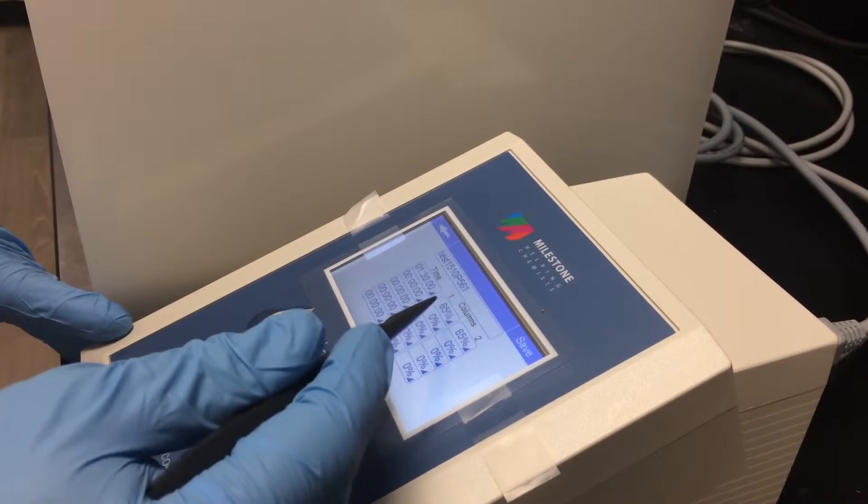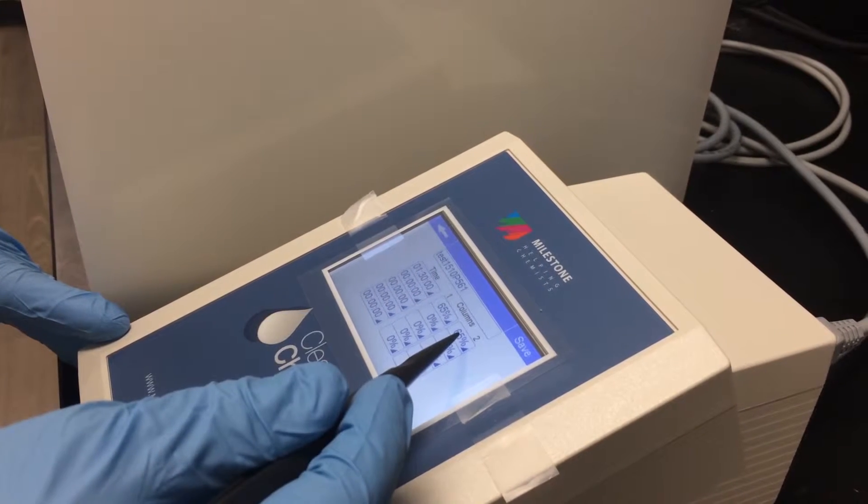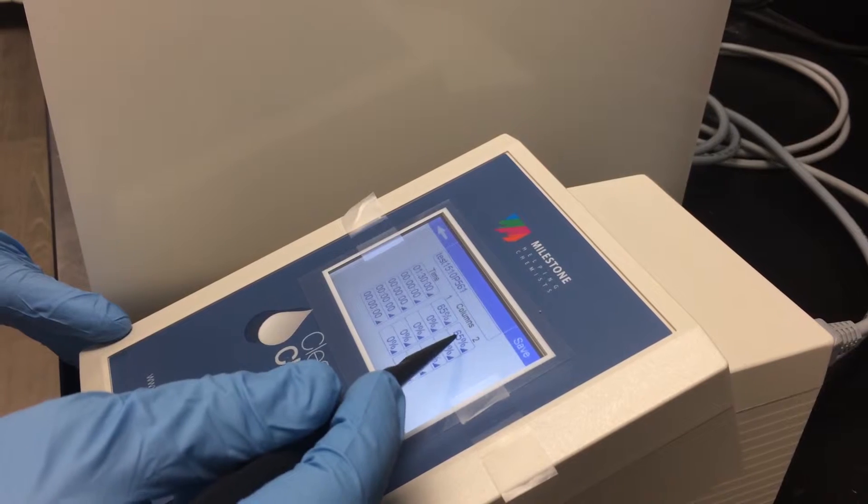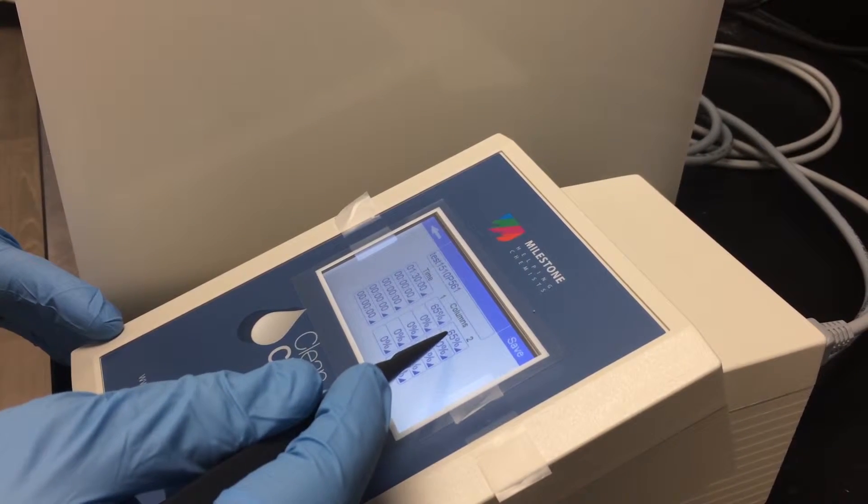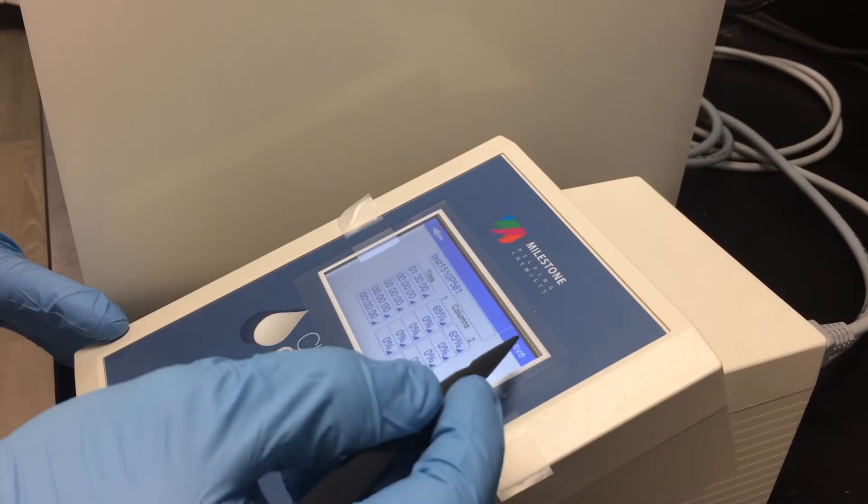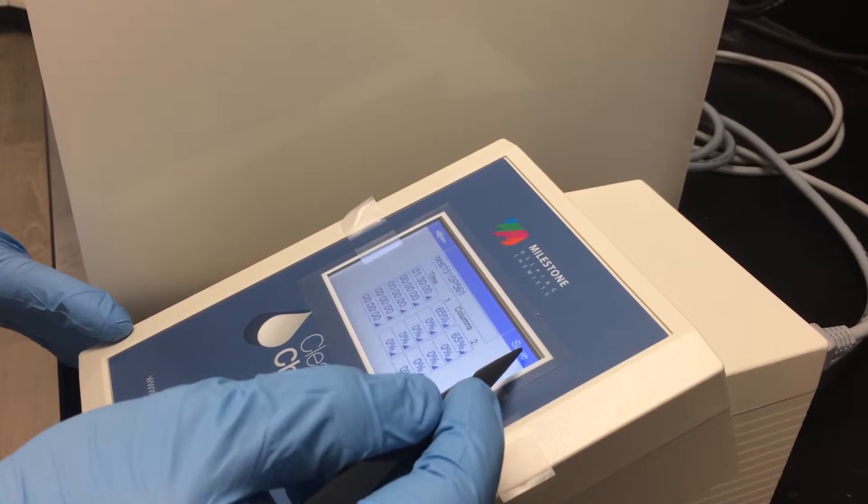If you notice we have the ability to use different power in each of the two distillation chambers allowing you to run two separate types of acid at the same time. When finished we'll click save in the top right hand corner.